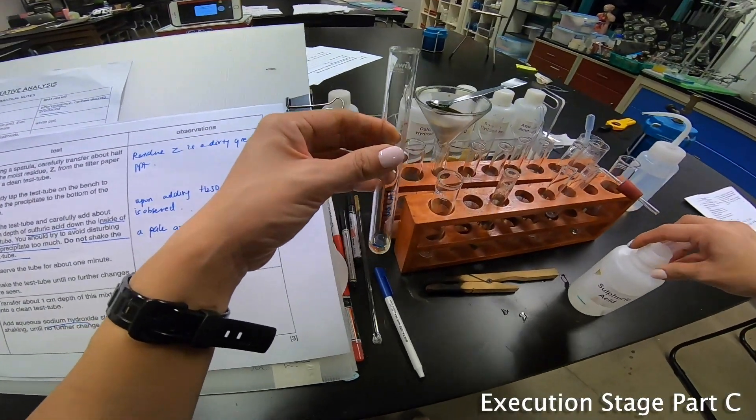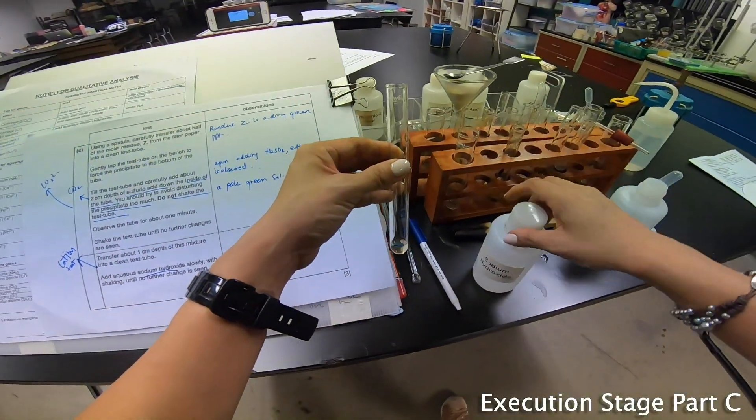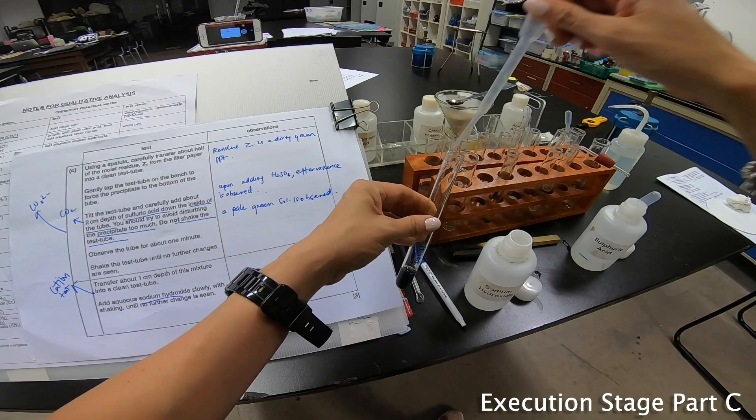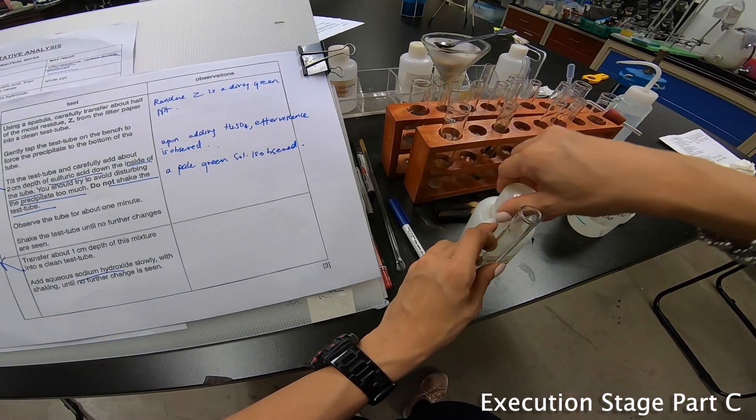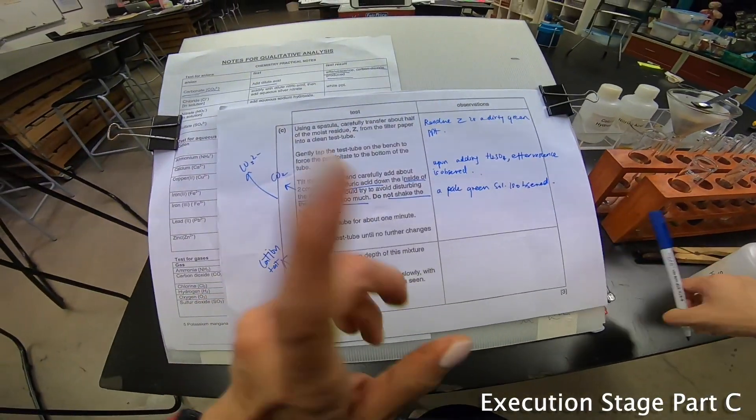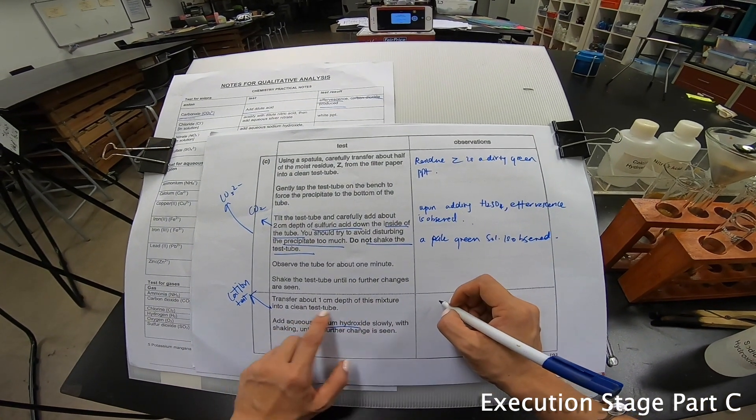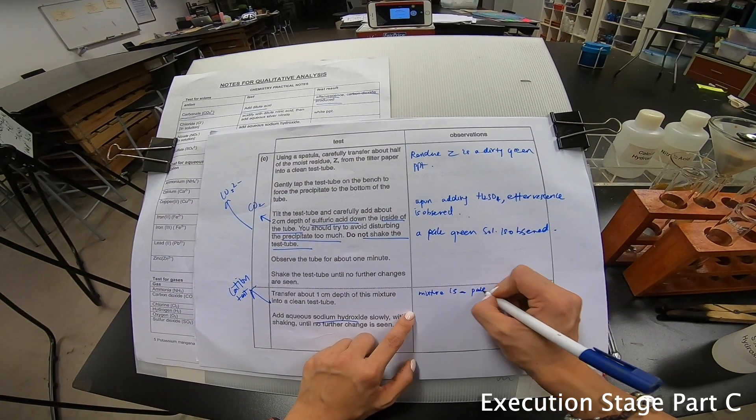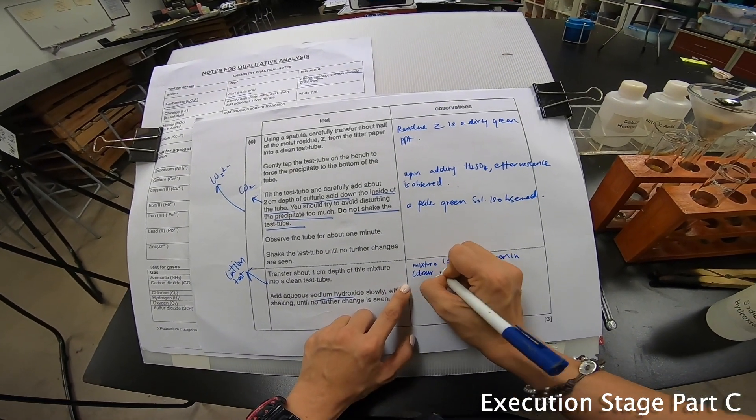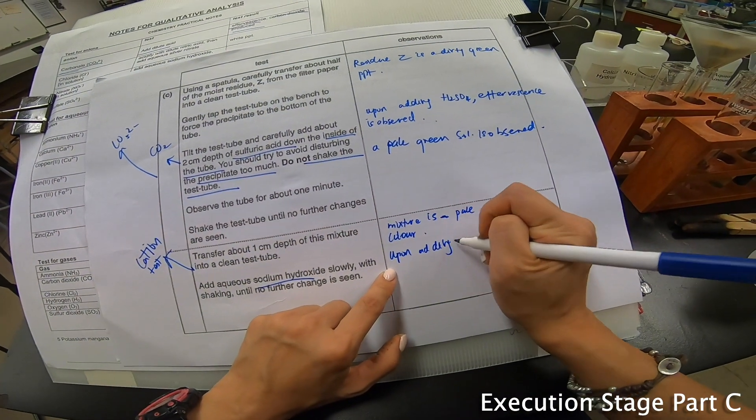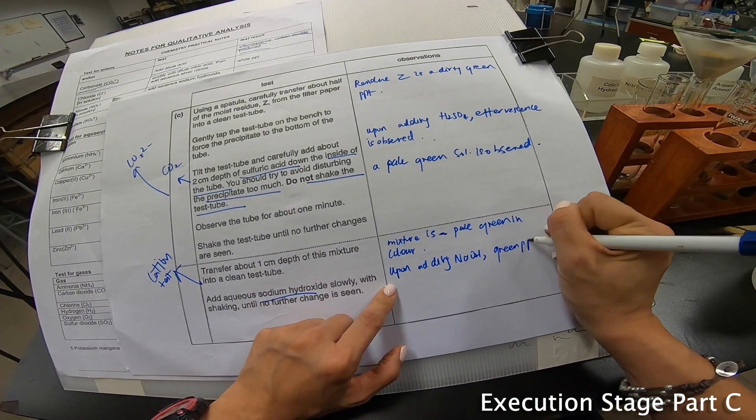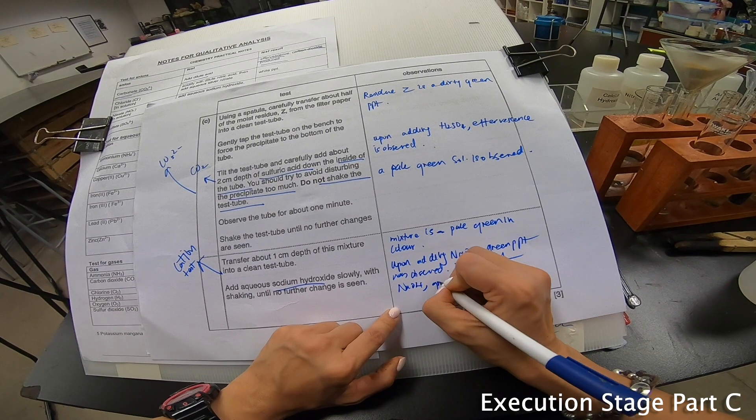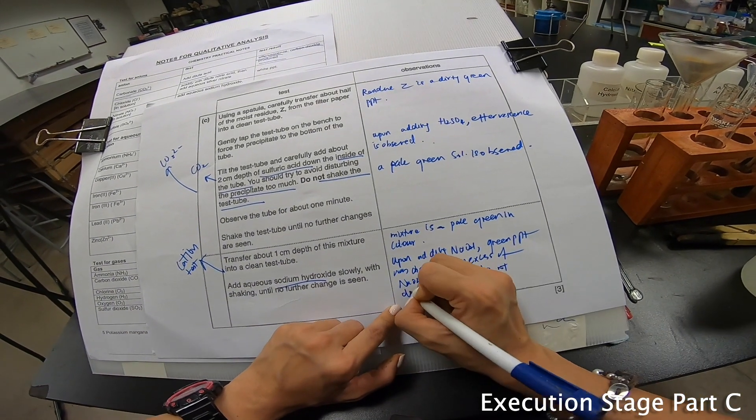Over here I'm going to add sodium hydroxide. Dirty green precipitate is formed. Add some more - dirty green precipitate does not dissolve in excess. Now you notice I do it pretty fast over here. Transfer one centimeter of this mixture. The mixture is pale green in color. Upon adding NaOH, a green precipitate was observed. In excess of NaOH, green precipitate does not dissolve.